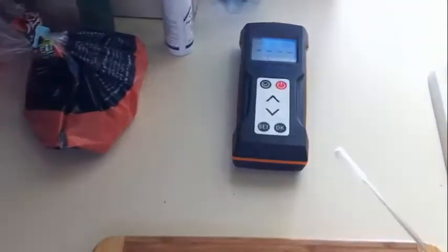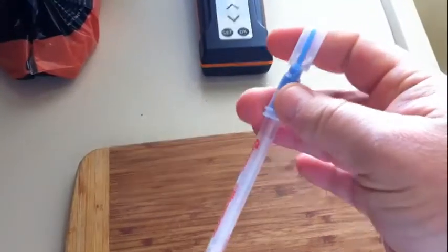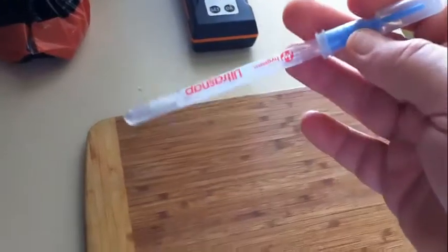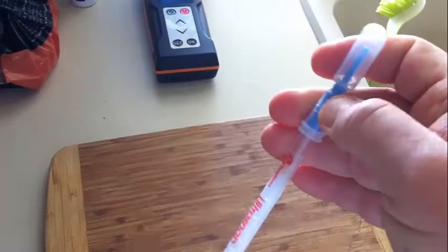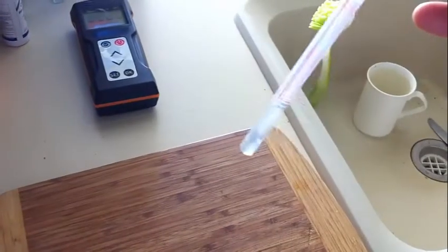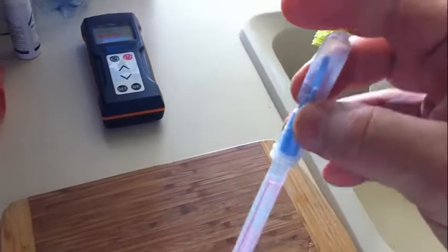Then we put it back into the swab holder — so this is the swab holder there. You can leave that like that for an hour or so without it affecting it. Once you crack the thing at the top and then squeeze it down to make sure all the fluid goes down to the bottom. Now you can see all the fluid has moved from the top into the bottom, and then you give it a good shake.